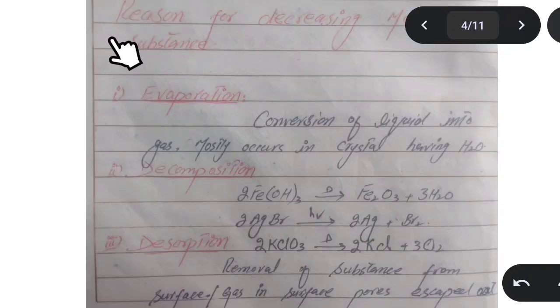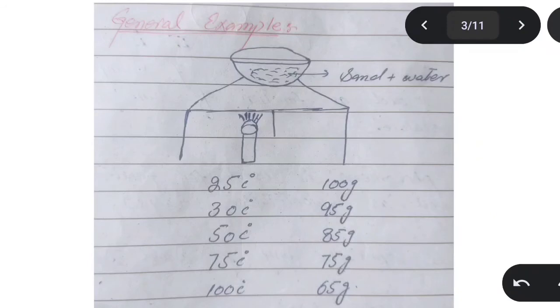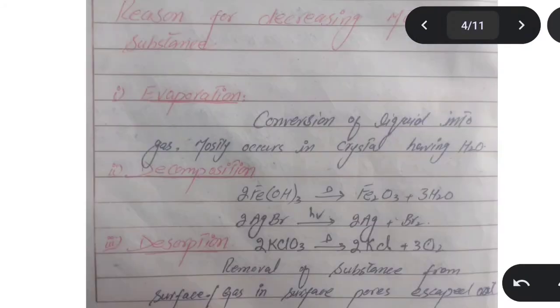Here is also a most important short question: the reasons for the decrease in the mass of a substance. What are the reasons behind why the mass of a substance is decreasing? The first reason is evaporation, second is decomposition, then desorption, adsorption, and water of crystallization. These are the 5 reasons responsible for decreasing the mass of a substance. First one is evaporation. As we have seen in our previous example, when we increase the temperature of this mixture, the liquid water changes from the liquid state into the gaseous state. This phenomenon is known as evaporation.